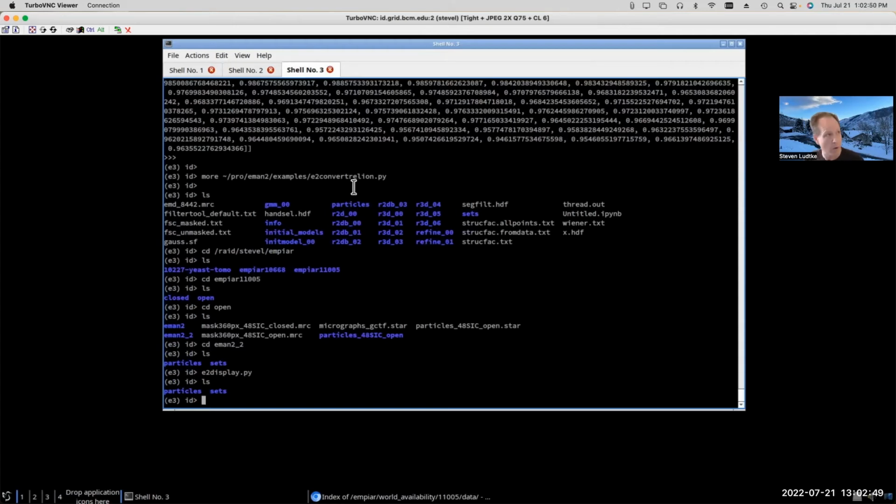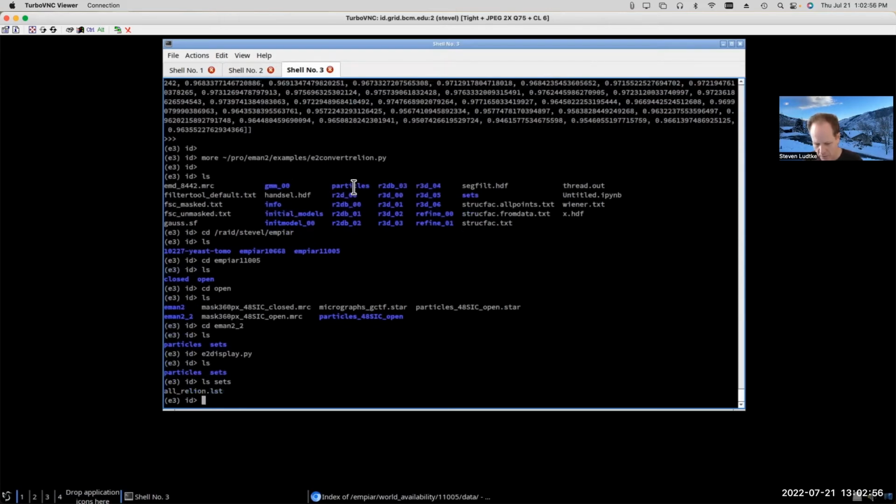Okay, so now what we should be able to do, although I'm not going to try it right now because it's going to take a little while to run with this many particles, is just do a make 3D on this Relion LST file and do an EMAN reconstruction of the Relion, using the Relion orientation, CTF, et cetera, parameters, and get a 3D structure out. And that's something that we're going to need when we try to run the Gaussian mixture model.